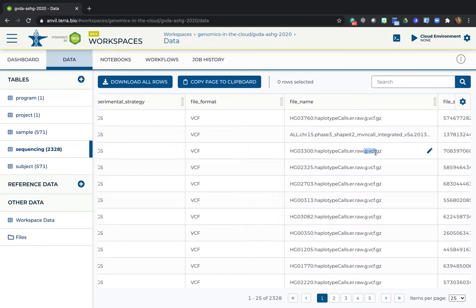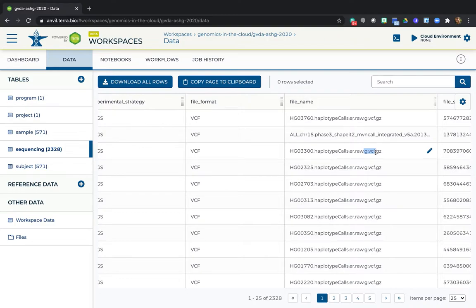GVCF stands for Genomic Variant Call Format. It's an intermediate form of variant calls generated per sample that you can use to do a variant analysis across a cohort through a process called joint genotyping. And this is done with a toolkit called GATK for Genome Analysis Toolkit.